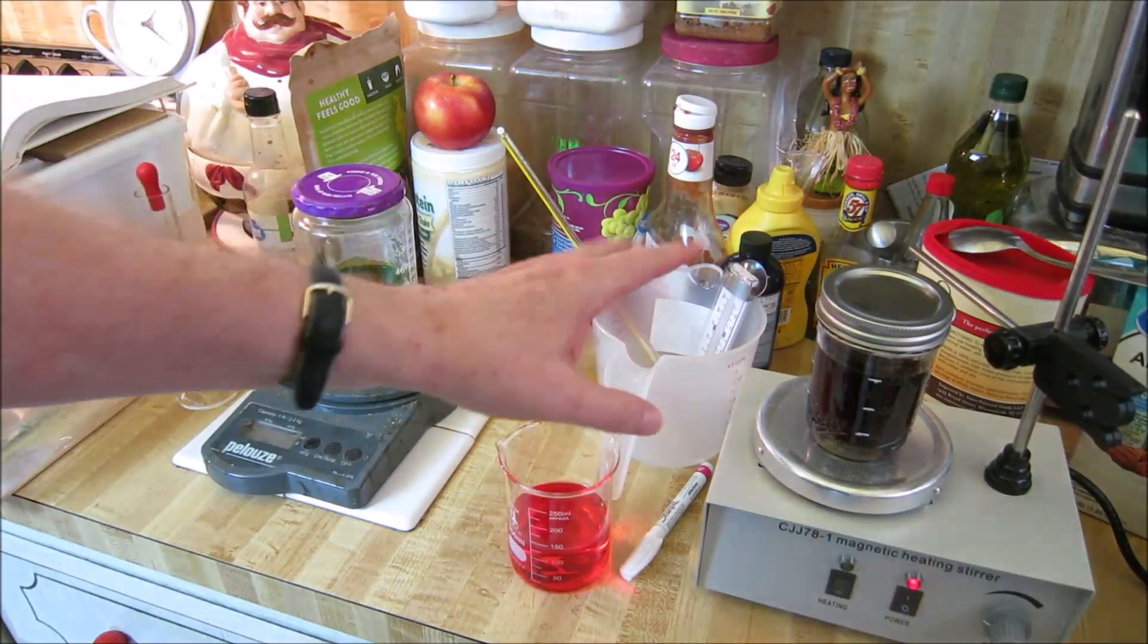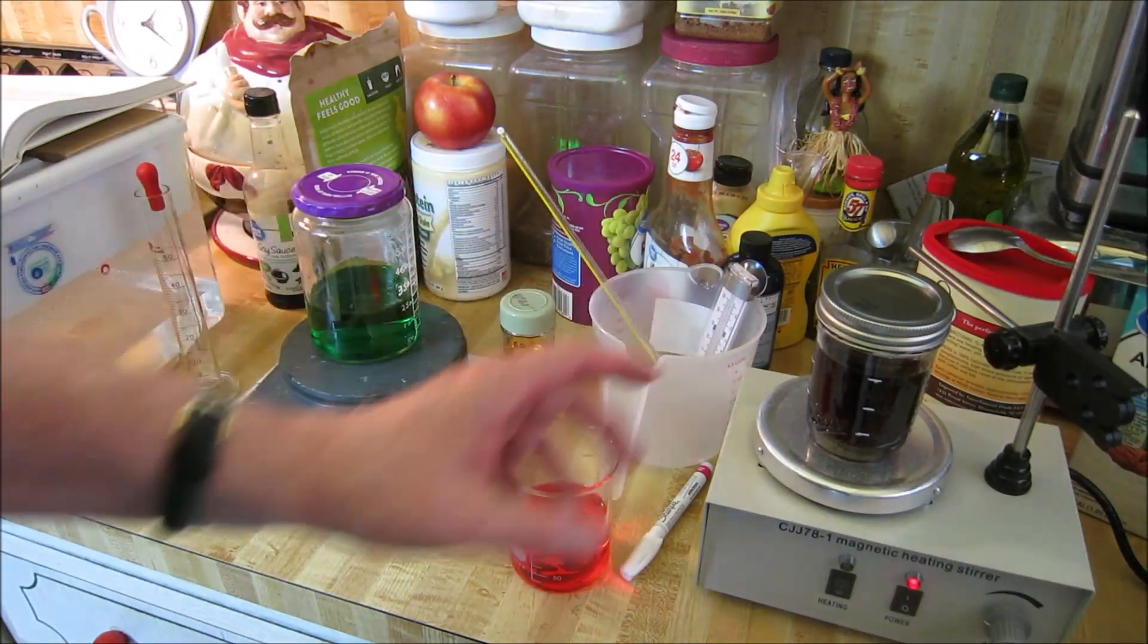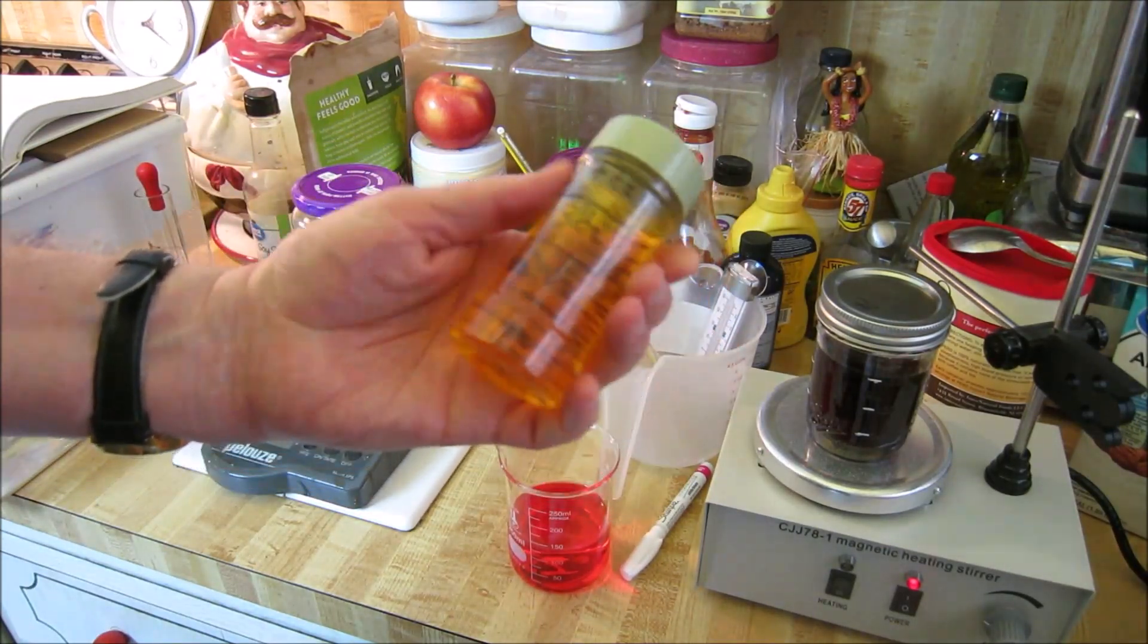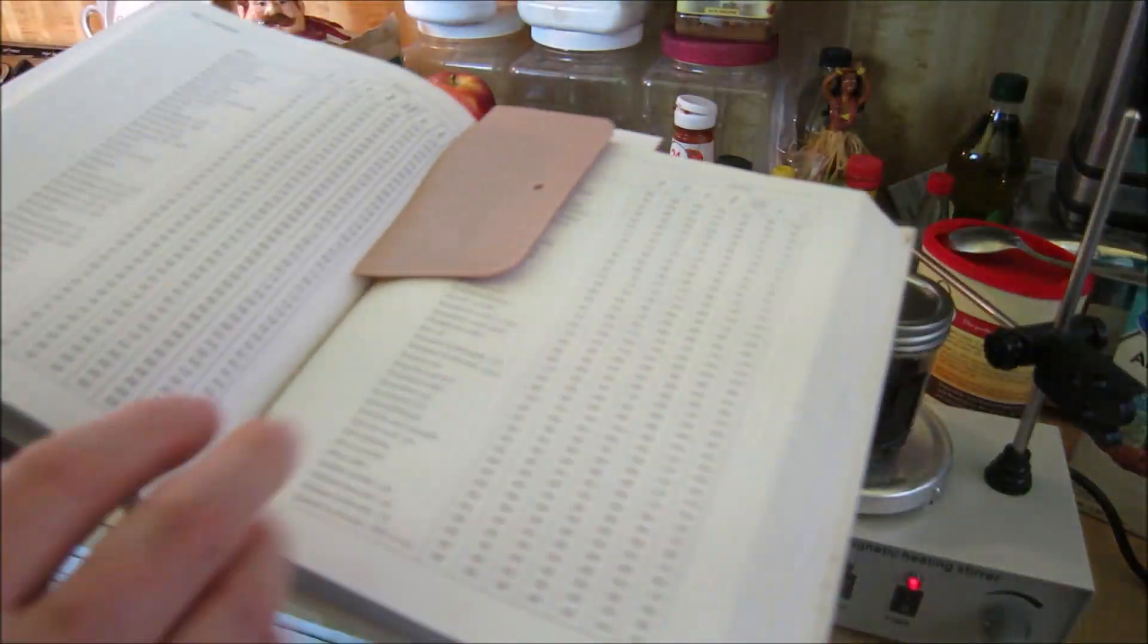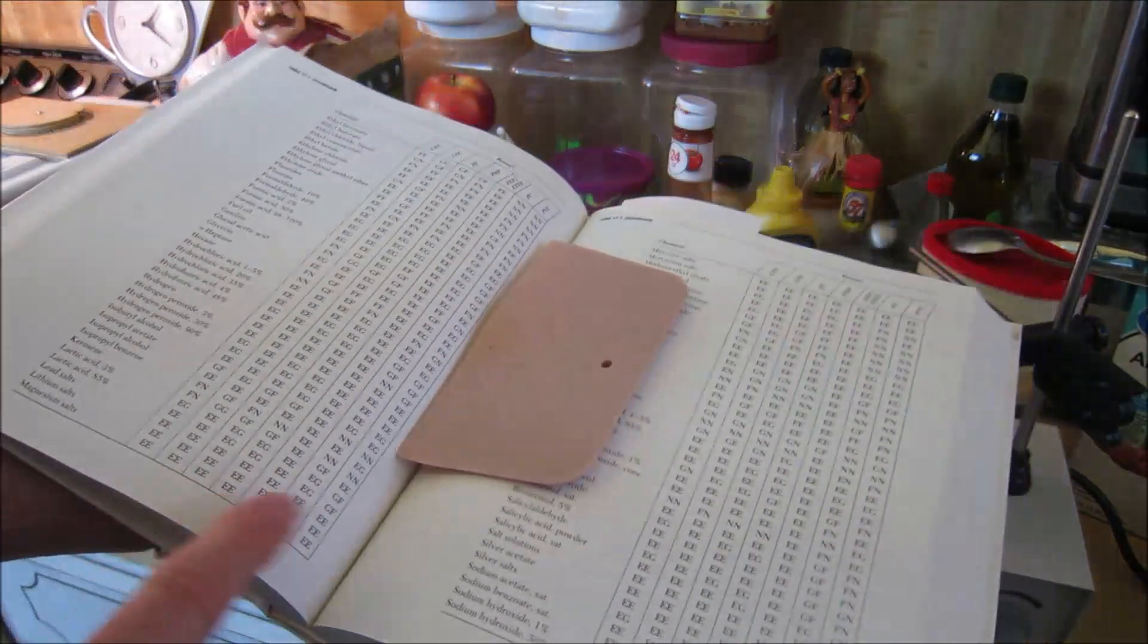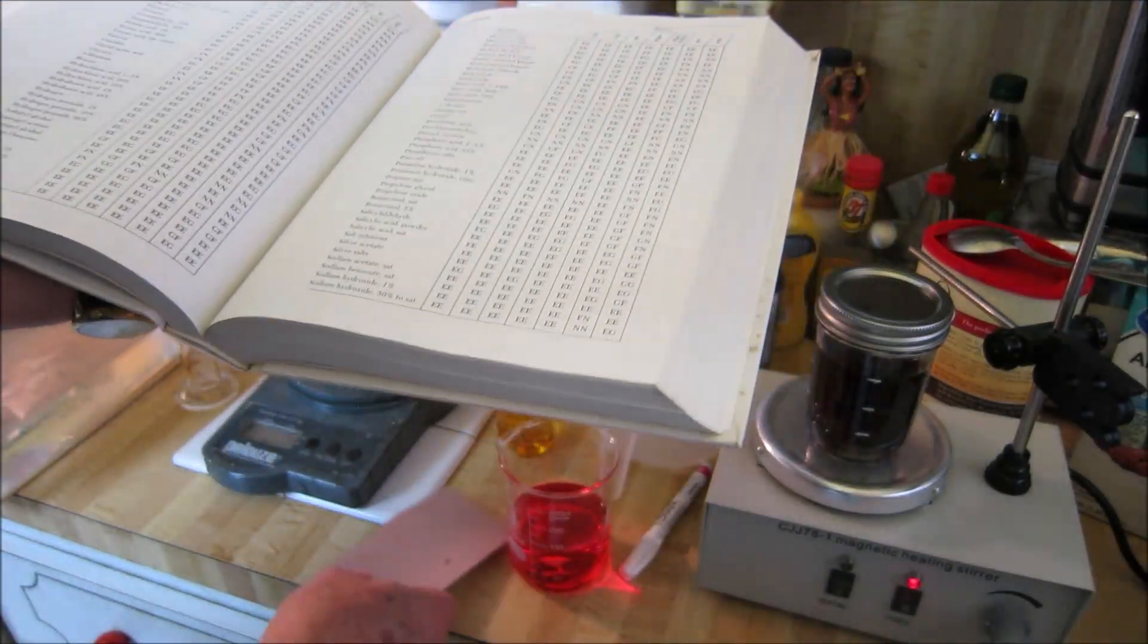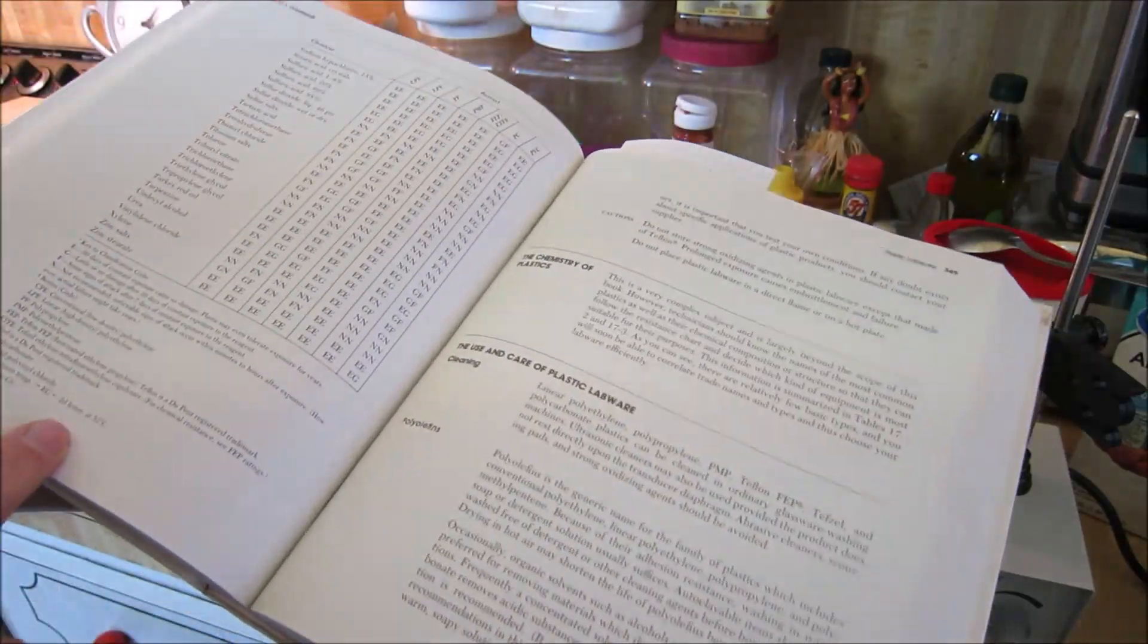So those are the two things for making glassware. You want to get water at 20 degrees centigrade, use a scale and one gram per ml for measuring. You could also use plasticware. I'll show you in the lab book. It has all the information you would ever want on different plasticware and what different chemical components react with it or doesn't react with it.